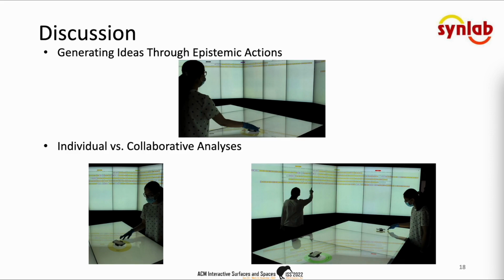However, further study is needed to understand the relationship between epistemic actions and ideas, as well as to understand how different kinds of interactions can support users in moving from observation to ideas to interpretations in the analysis of complex data. We structured the study tasks as individual data exploration followed by collaborative interpretation, based on the existing practices of our biology collaborators, who frequently shift between individual and group work.